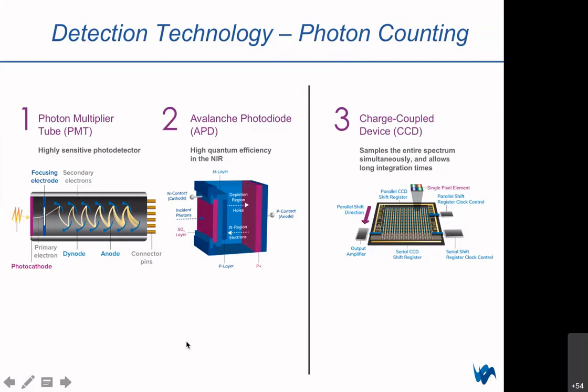Moving on from there, the charge coupled device, CCD. It's a device for the movement of electrical charge, usually from within the device to an area where the charge can be manipulated, such as conversion into digital value. This is achieved by shifting the signals between stages within the device one at a time. CCDs move charge between capacitive bins in the device, with the shift allowing for the transfer of charge between bins. Pixel binning is a way to control the gain of the CCD, but not all CCDs are the same. Let's take a dive deeper.